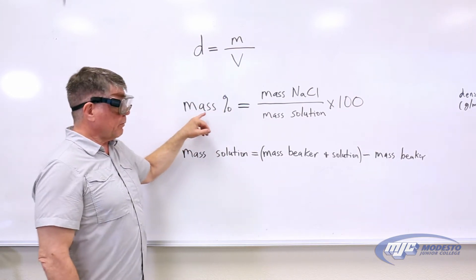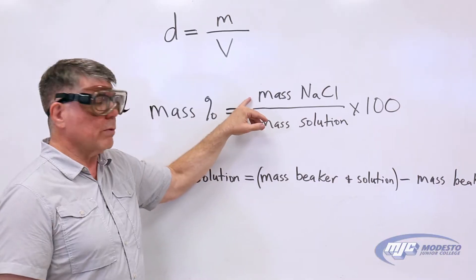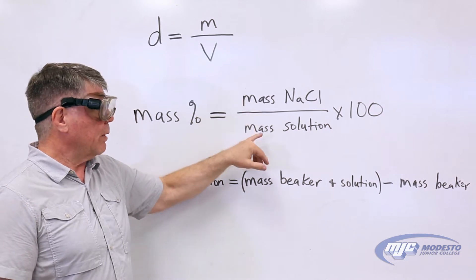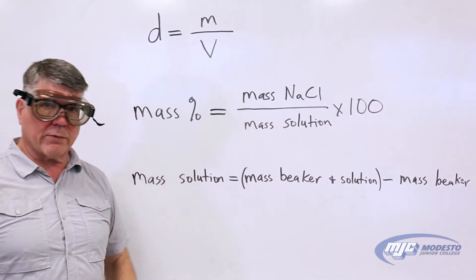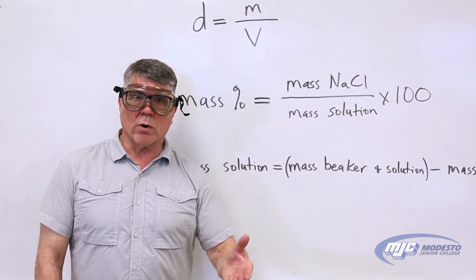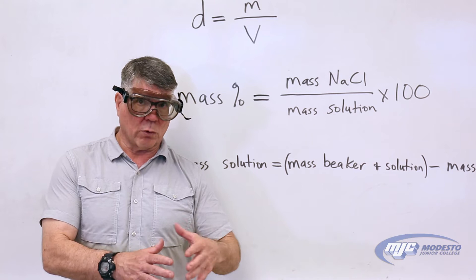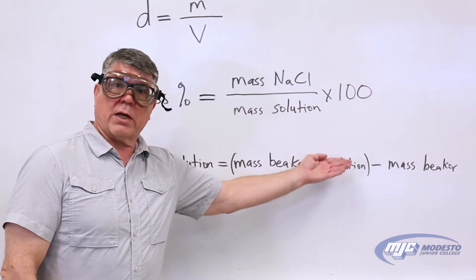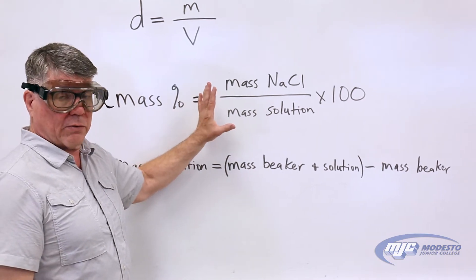Now mass percent — remember that's the mass of the solute divided by the mass of the solution times 100. In this case the solute is sodium chloride. We're going to measure how much sodium chloride there is and the mass of the solution. The way we have it set up, we're going to measure out the sodium chloride by itself, then add the water. We're going to measure the mass of the empty beaker and then the mass of the beaker with the whole solution in it. To get the mass of just the solution, we take the mass of the beaker with solution and subtract out the mass of the empty beaker.